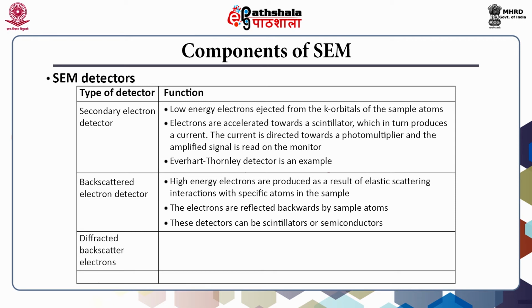Diffracted backscattered electrons can be used for determining crystallographic structure of sample. These electrons can also be used for determining orientation of minerals and microfabrics.